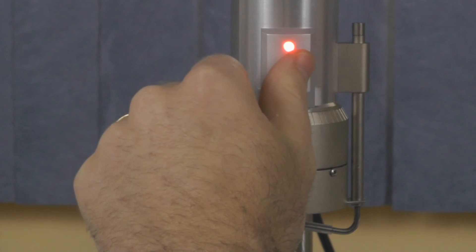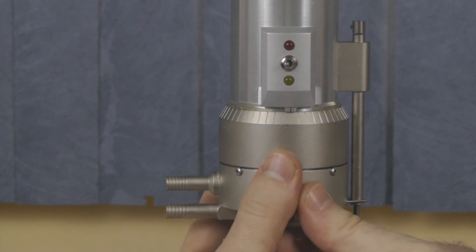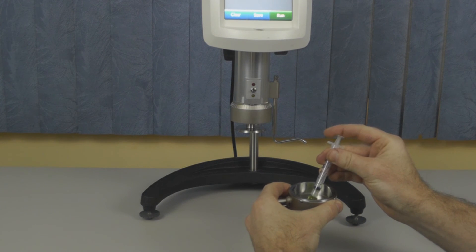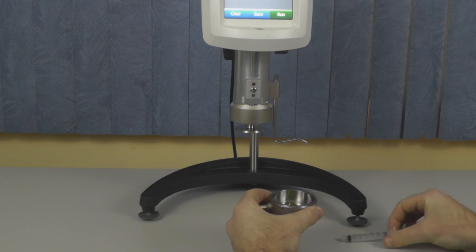You can now turn off the toggle switch, take off the sample cup, and load your sample. Once you have loaded the correct volume of sample onto your cup, you can reattach it to the instrument.